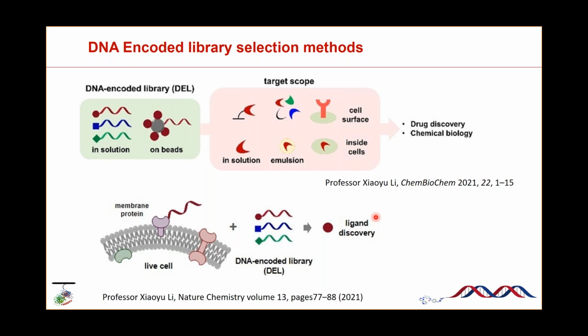Okay, thank you. Can we try DEL technology with a DEL service such as OpenDEL? Yeah, sure, definitely, you can try OpenDEL, and there are several companies that currently provide it. But they also provide different selection methods. You just need to pick the best one to fit the target you want to screen. Okay, thank you.